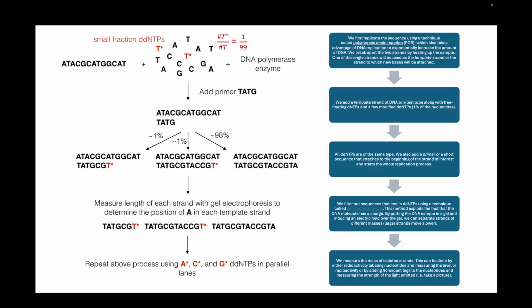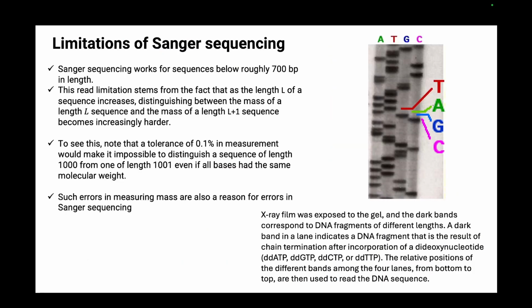We'll come to this technique. Illumina uses a similar technique, but we'll come to that. This is the basis of sequencing for many types of sequencing technologies. It was first used during Sanger's time, and after that it has been developed for Illumina and other technologies as well. Moving on, we understood how Sanger sequencing works, but there are a large number of very active limitations of the Sanger sequencing process. That is why nowadays it's not used.